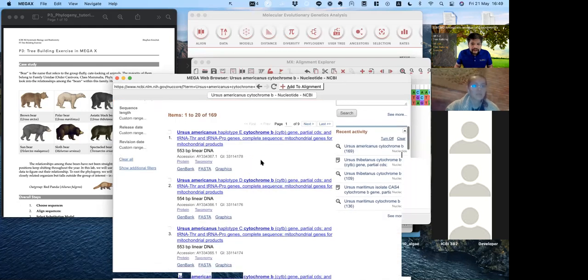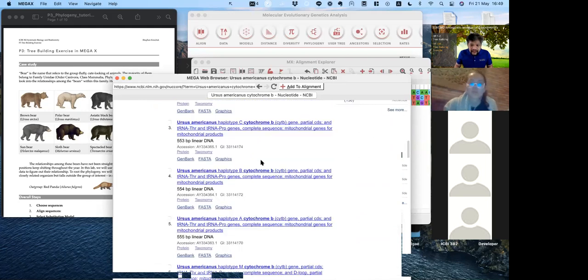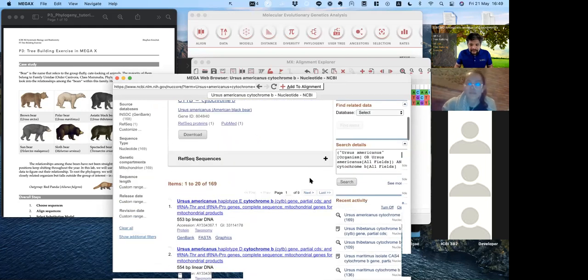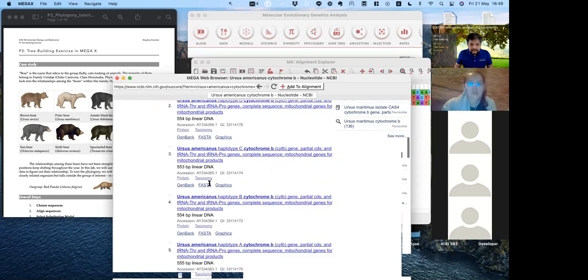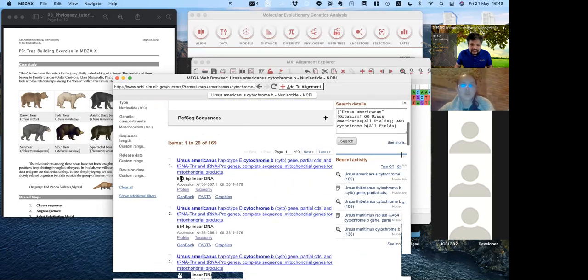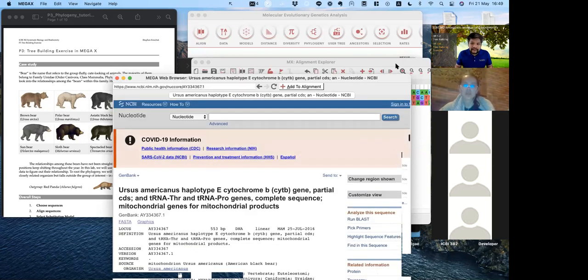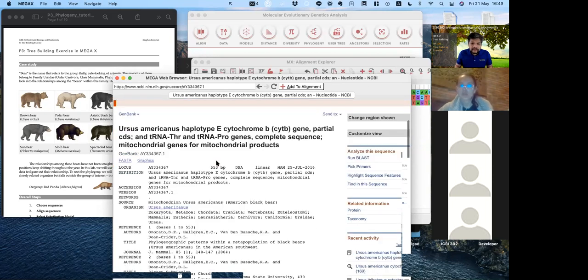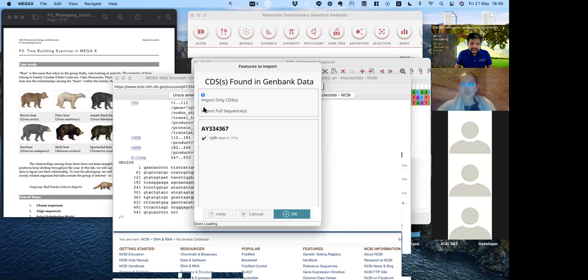This is something you should start worrying about: now the cytochrome B entries also have other regions built in with them. This is okay, but make sure they at least have cytochrome B inside, and the length is about the same. So it's 500 now, which is not longer. Sometimes, because we now have more data in the database, they include the genomes in there, which is not what we want. The genome is a lot longer. It would make it difficult to align.